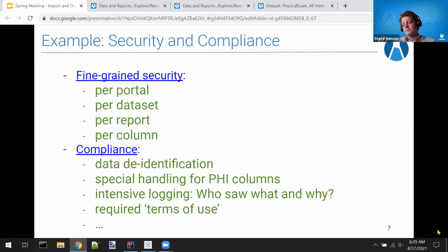It can pull from Postgres, SQL Server, Oracle, MySQL, and others. By the time it gets to the study module, LabKey doesn't even distinguish between the different databases. They're all interanalyzable, and there's really an abstraction layer in LabKey around the databases. As a data analyst, you don't even know what database it came from. It's just there available to be worked on.